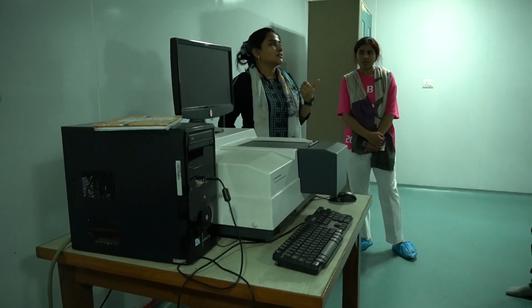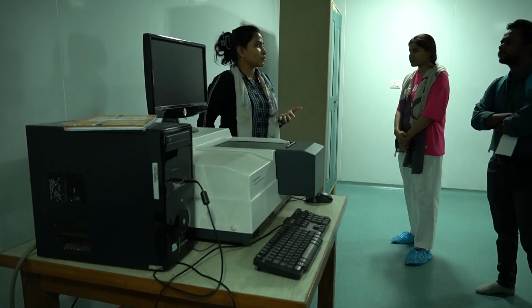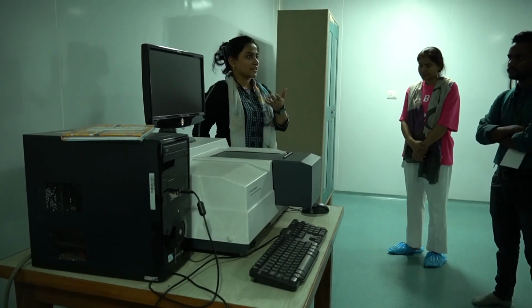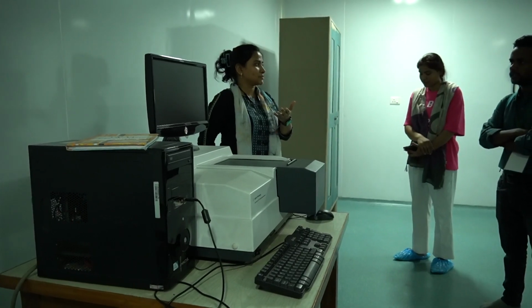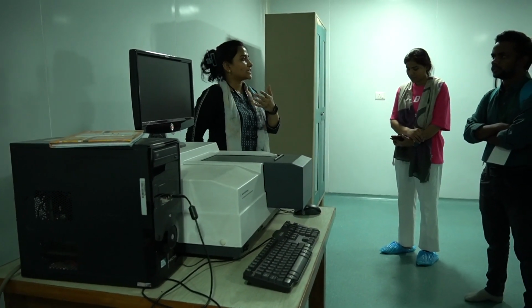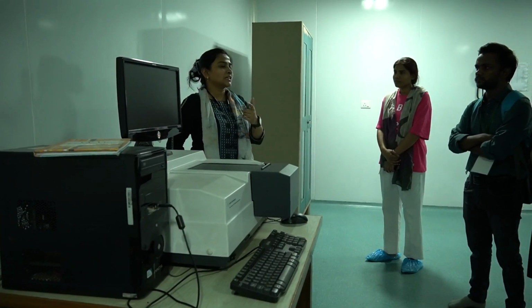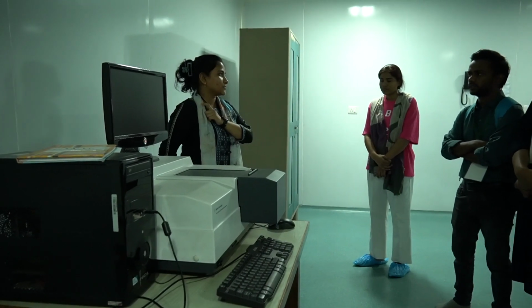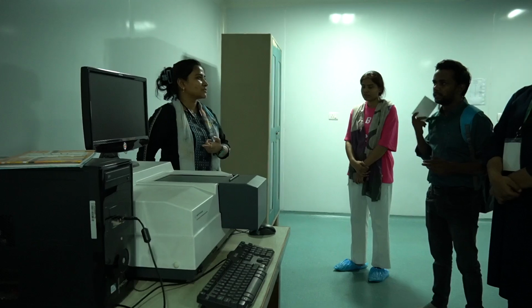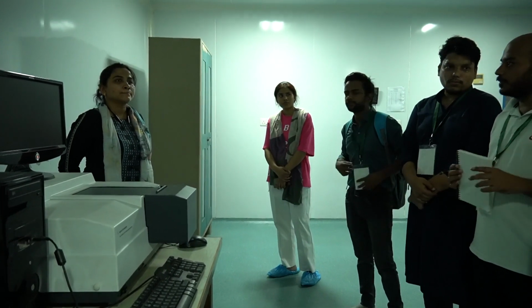रमन स्पेक्ट्रोस्कोपी हम जनरली कार्बन मटेरियल्स के लिए करते हैं। उन कार्बन मटेरियल्स में डबल बॉन्ड्स भी होते हैं, ट्रिपल बॉन्ड्स भी होते हैं, सिंगल बॉन्ड्स भी होते हैं, तो हम उस चीज़ को रमन स्पेक्ट्रोस्कोपी में डिफाइन करते हैं। और फंक्शनल ग्रुप्स वगैरह, अटैचमेंट जैसे COH या C डबल बॉन्ड N, ये सारी चीज़ें हम FTIR में यूज़ करते हैं। और यूवी स्पेक्ट्रोस्कोपी तो क्वांटिटी एनालिसिस होती है, कंसंट्रेशन और ये सारी चीज़ें। इसमें रमन का सोर्स क्या है?